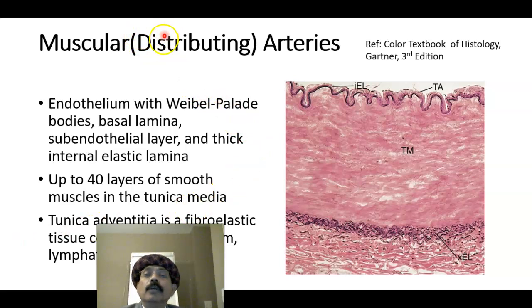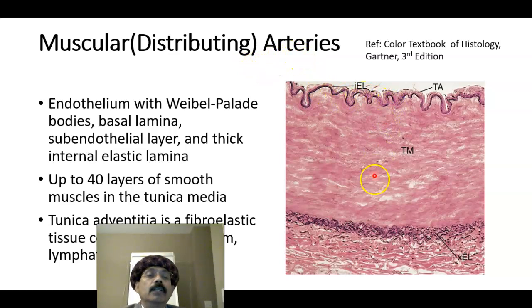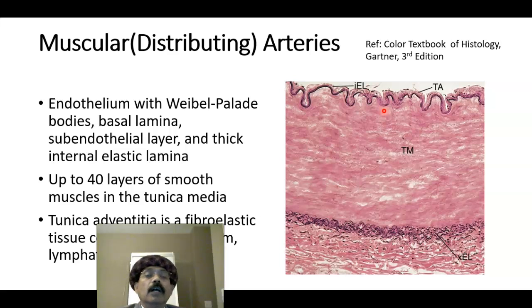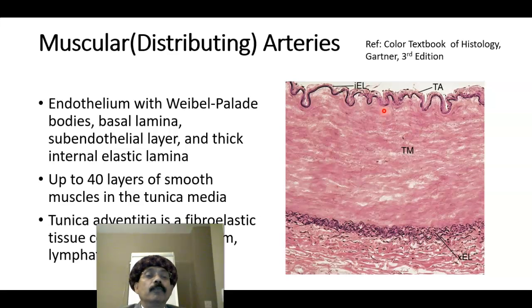Here we are looking at another slide of muscular arteries. Remember that muscular arteries are the most numerous arteries — examples include the brachial artery, radial artery, ulnar artery, popliteal artery, and femoral artery. As a rule, they may contain up to 40 layers of smooth muscle in the tunica media.